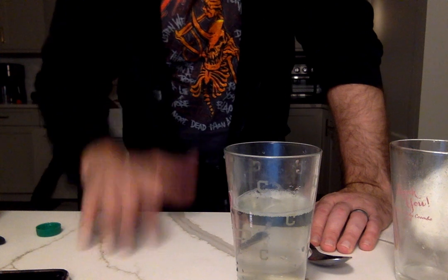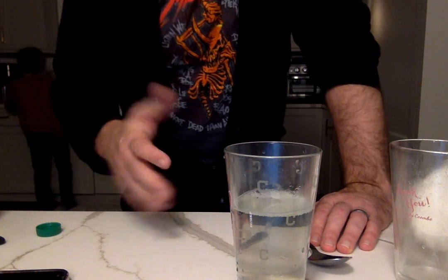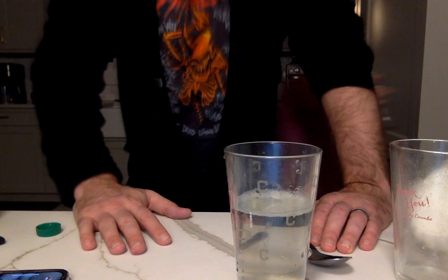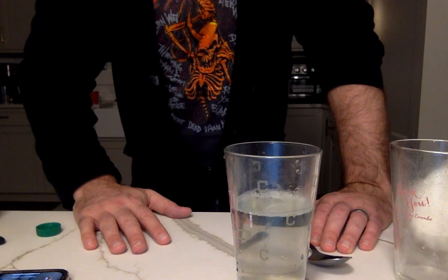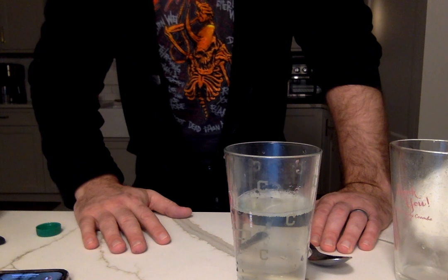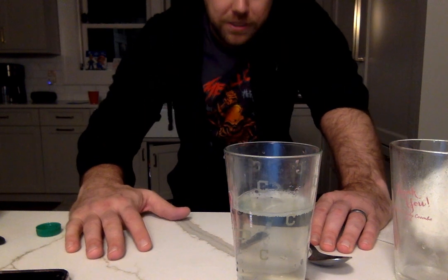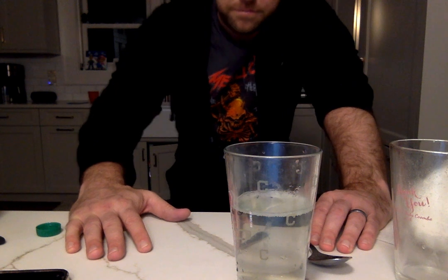But overall, the timing of the color change provides information about the rate of reaction, which is what we're studying. It makes a useful experiment for studying reaction kinetics and the factors that influence them. So that's my video. Unfortunately, my experiment didn't work, but you can't win them all.